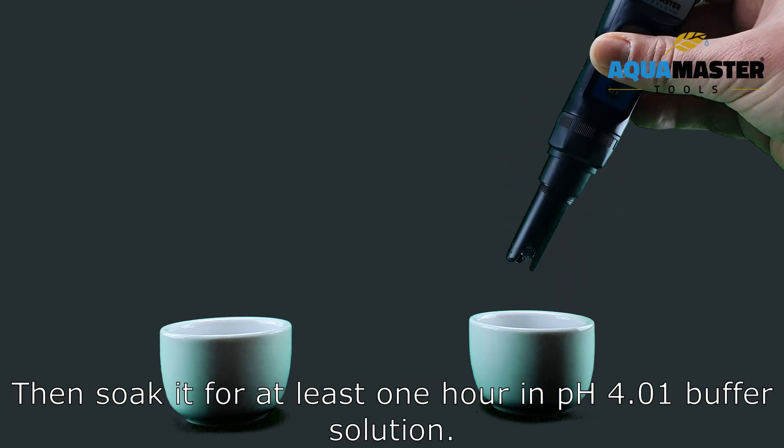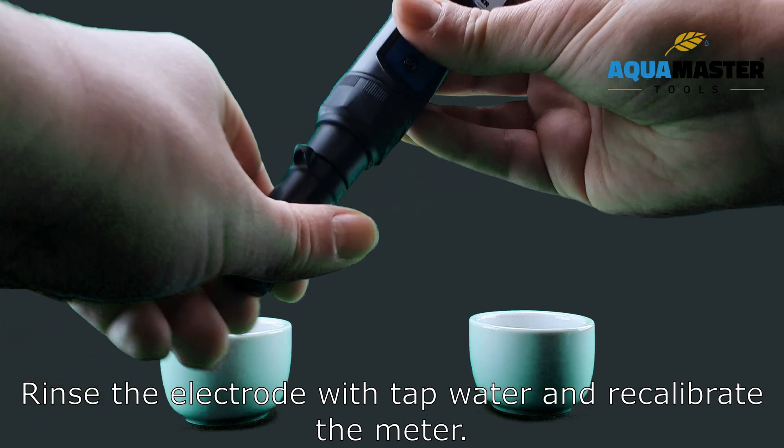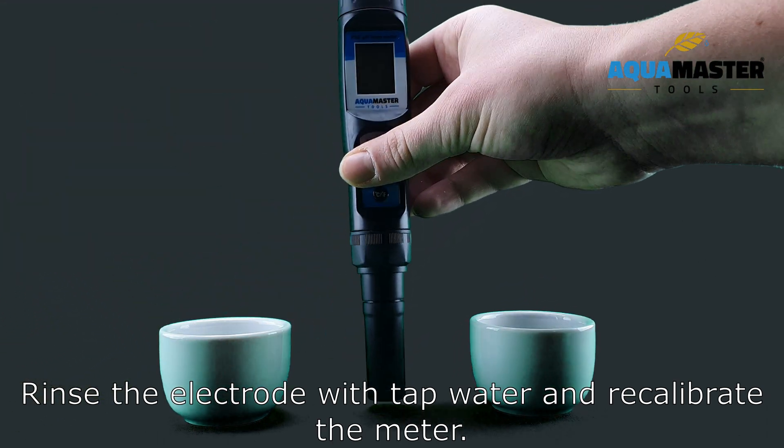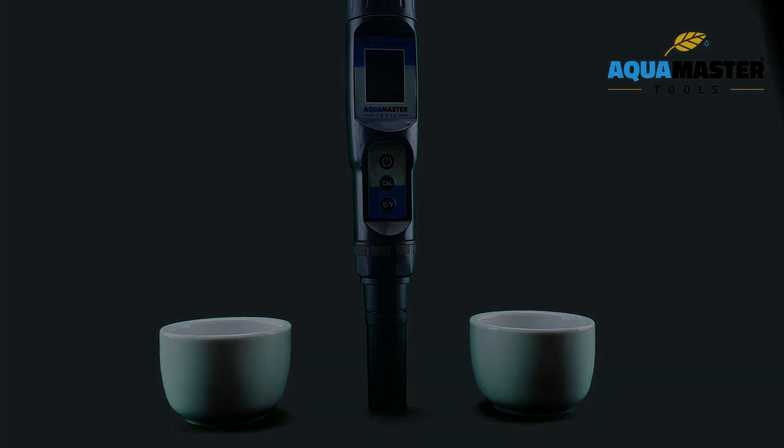Then soak it for at least one hour in pH 4.01 buffer solution. Rinse the electrode with tap water and recalibrate the meter. The meter should now work again if the contaminated electrode was the problem.